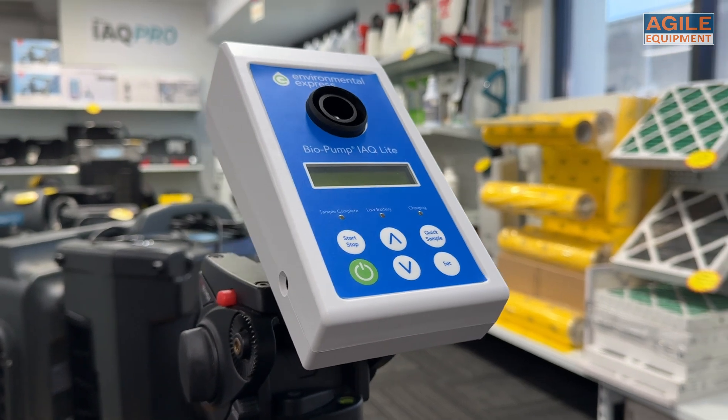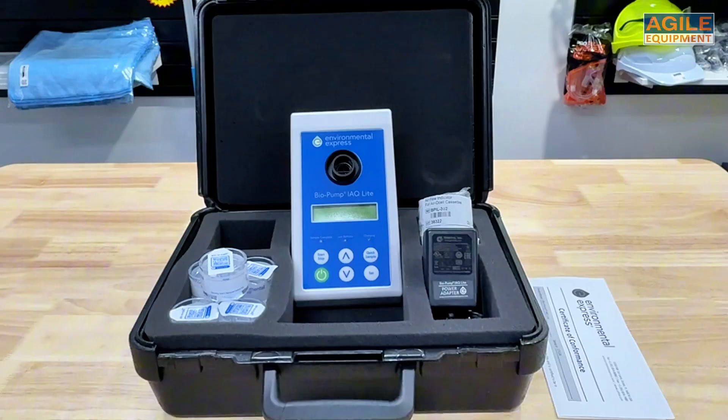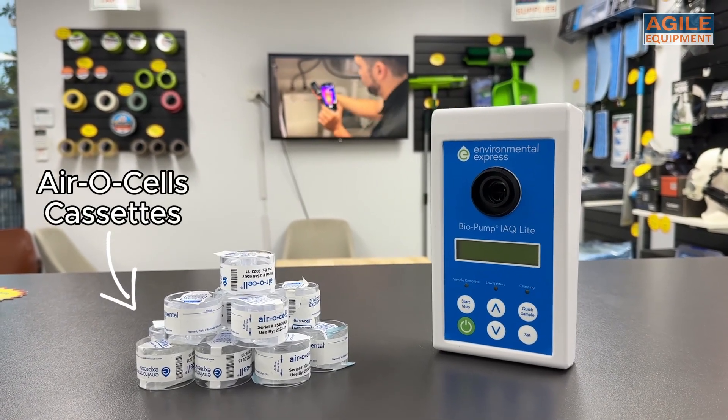This new indoor air quality pump continues that legacy, offering a reliable way to sample air using aerosol cassettes, which you can also find right here at Agile Equipment.